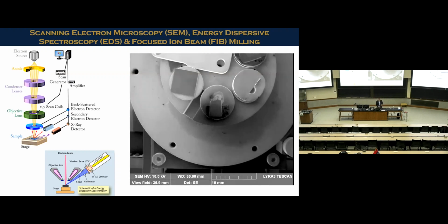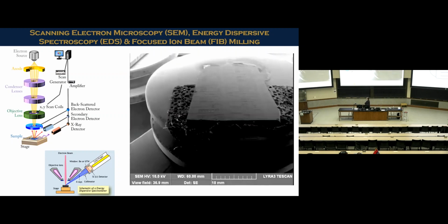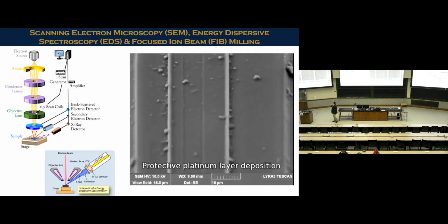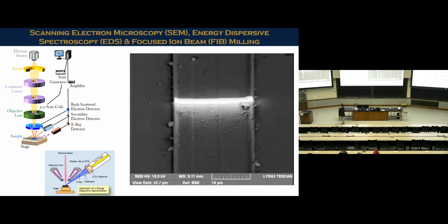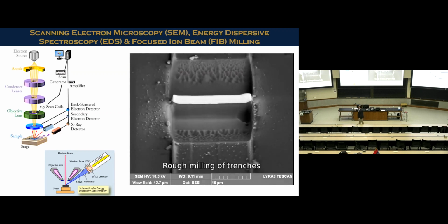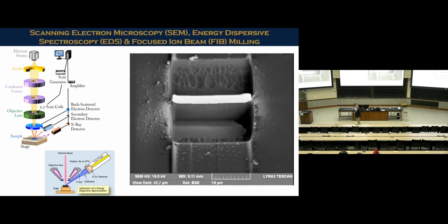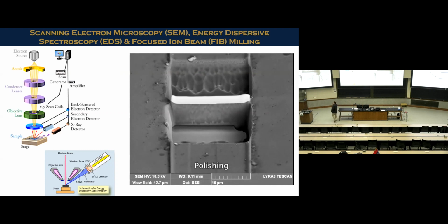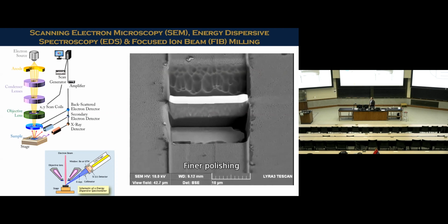So I'm going to play a video here. You can see this is an object, it's not a coin. And what we are doing here is you can zoom in, focus, and this is 10 micrometers, about 10 times thinner than a human hair. And we can mill this area with an ion beam. So the entire sample still stands. We are not destroying it, but we can make a small cross section here for analyzing and imaging. You would not be able to see this damage by eye. You just need to go to the microscope to see it again.